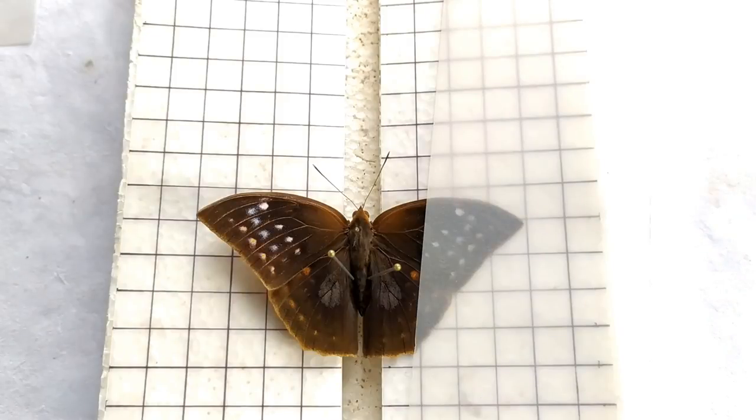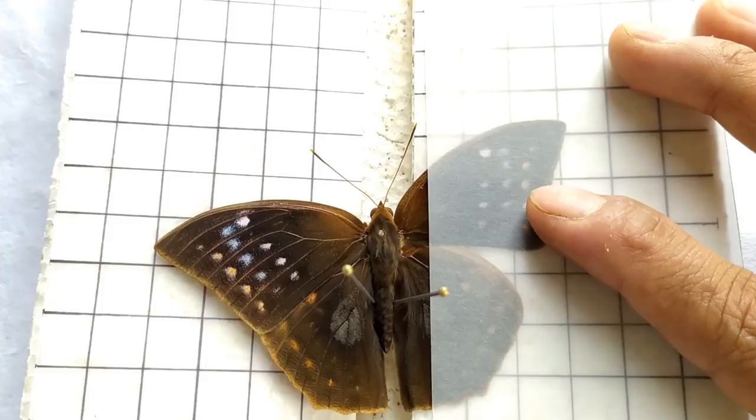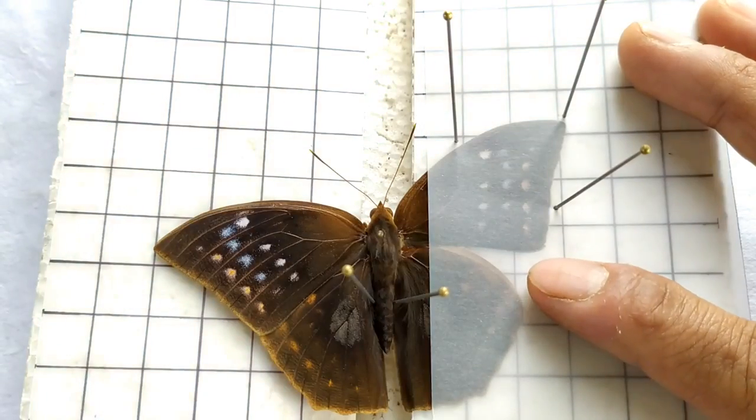For the spreading process, take a sheet of butter paper and place it on top of the wings on one side. Hold the forewing at its thickest part, called the costal vein, using either a fine-tipped pin or a tweezer, and slowly and carefully pull the wing upwards until the inner margin of the forewing is approximately at 90 degrees to the body. Secure the wing in this position by inserting pins through the butter paper at several places along the margin of the wing.